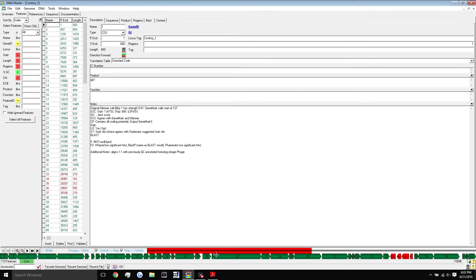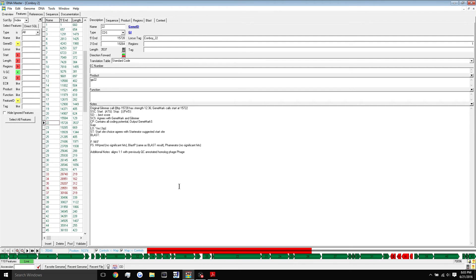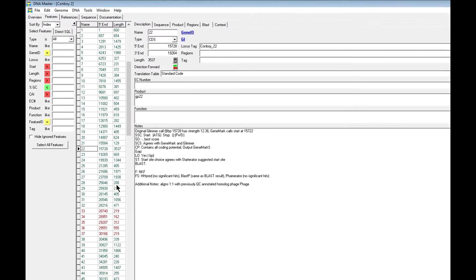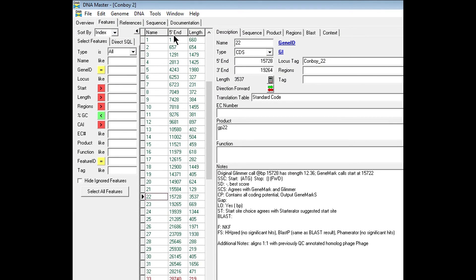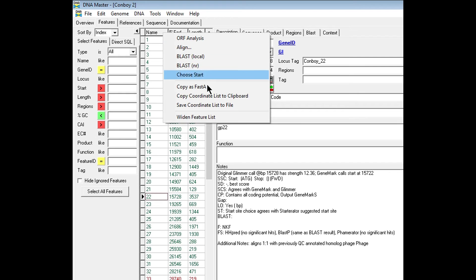If you click on a gene, it will bring it up in the window here. It will bring up gene 22. As you saw, I clicked that one and gene 22 came up in the notes. When working in DNA Master and starting your annotation, you'll definitely want to widen the feature list here. This is the feature list because it is missing two columns without it widened. All you have to do is come up to the top here where the title is, where the name, the five prime end, and the length are. Simply right click and hit widen feature list.